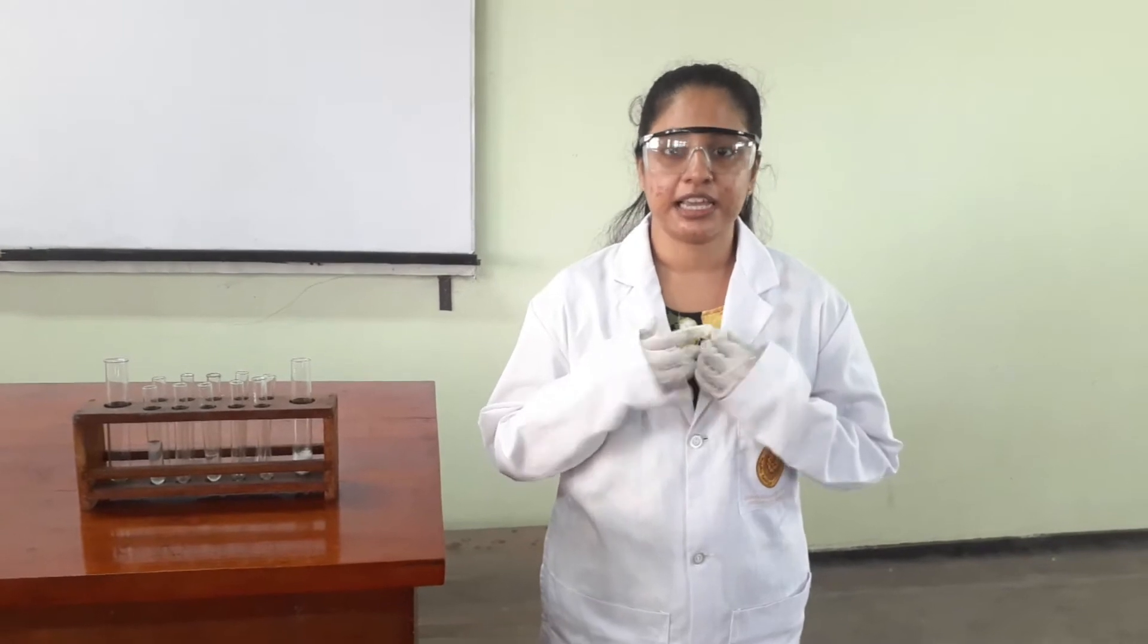When working in a chemistry laboratory, we have to ensure our safety. Therefore, we must wear protective glasses, lab coat, if required gloves, and covered shoes.